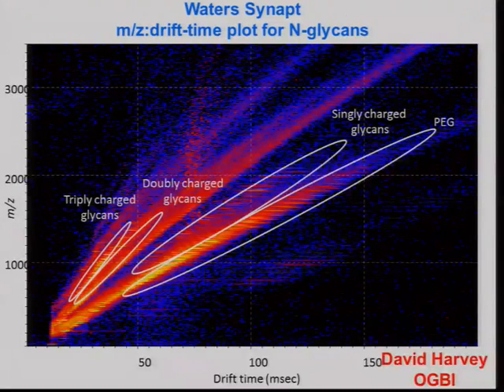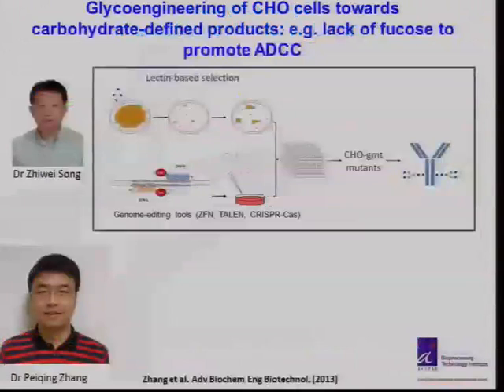And if you're going to look into the future, this is ion mobility. And this is a new technology that people are currently trying to predict where the glycans will run and just explore how powerful it's going to be. But if you have a Synapt with an ion mobility tube on the top, this is like chromatography in the gas phase. Basically, it's gas chromatography, but it's much more sophisticated than the old gas chromatography. So it will separate different charges of glycans, for example. So if you're a mass spec buff, this is a technique of the future, I suppose.